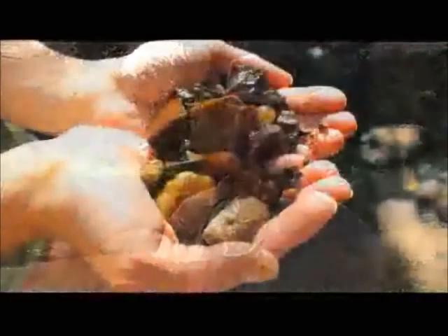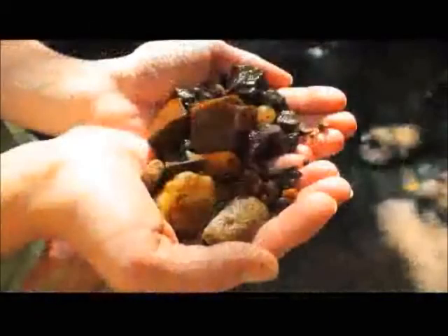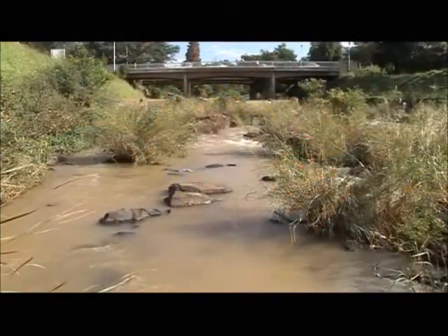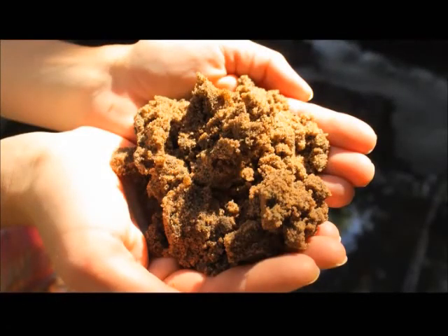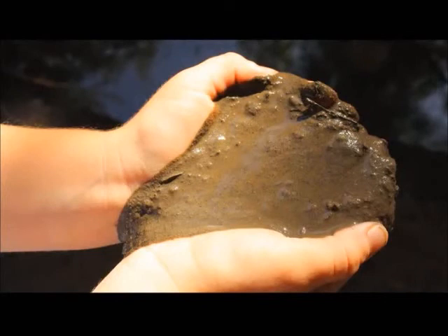Gravels are typically less than about 2 centimeters in size, and at the tail end of a riffle or below an island would pick up the gravels. The sand, on the other hand, would be less than about 2 millimeters, and classically we would know what a typical river sand would be on the edge of the banks, and combined with that would be our mud, and that would be sand going through to fine silt clay type fraction, and we would be looking at that as well.